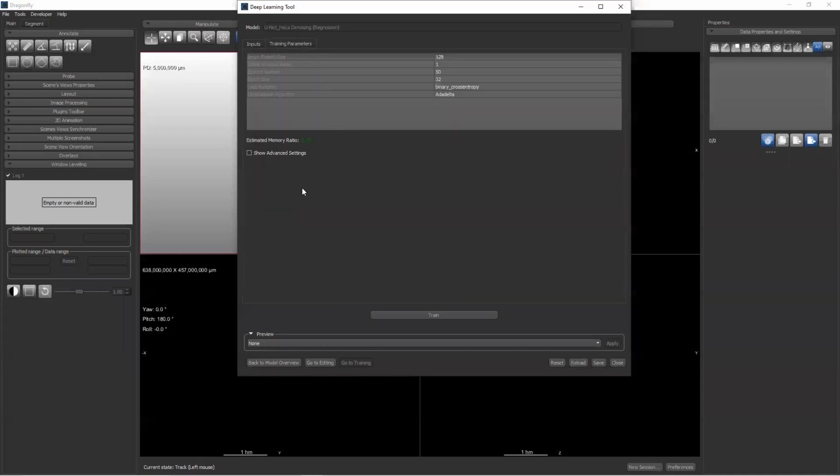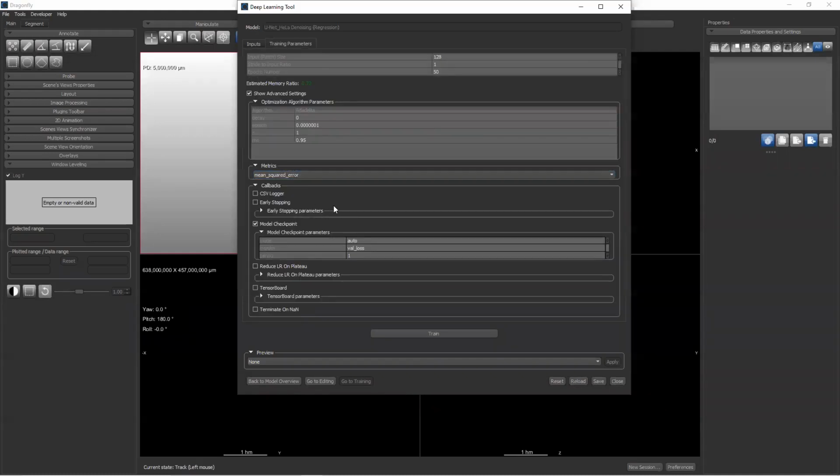Now, the other thing I want to draw your attention to is that under training parameters, there are advanced settings. I won't be going through all of this right now. However, I think I do have Benjamin on the call. So at the end of today's discussion, if you want to ask questions, Benjamin can talk to you about this.